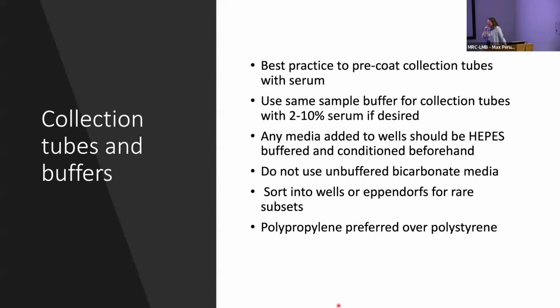Also, one of our sorters, the Bigfoot sorter, has what's called polarity flipping. We can set that up to also mitigate any additive effects of charge inside the sorted cell tube. Essentially, we can set it so that every certain volume of cells passed, it will switch the charge.